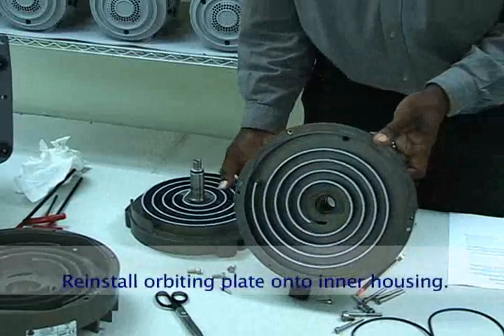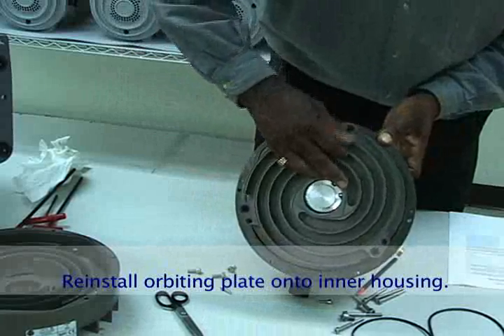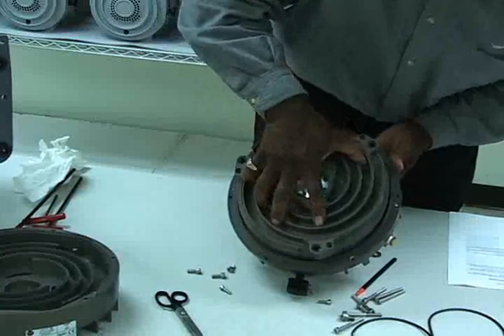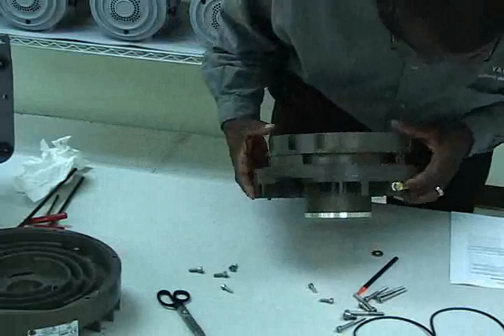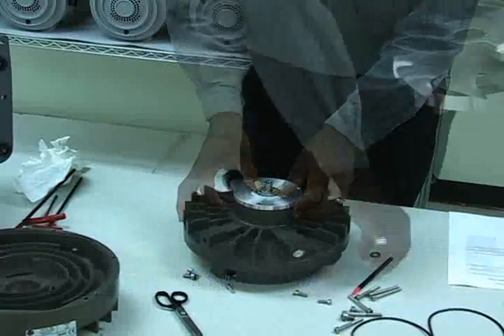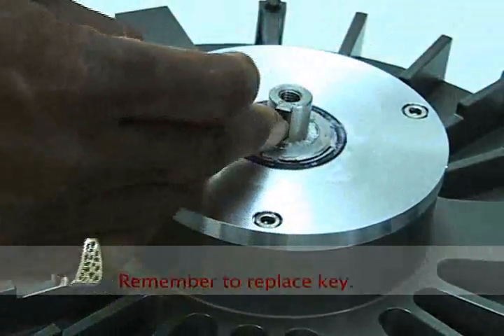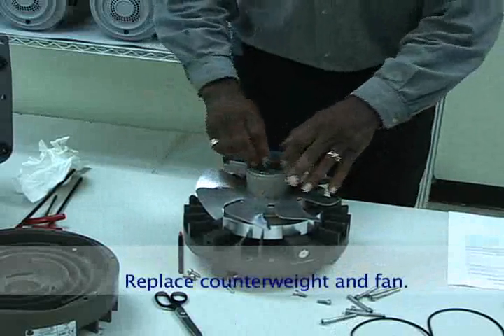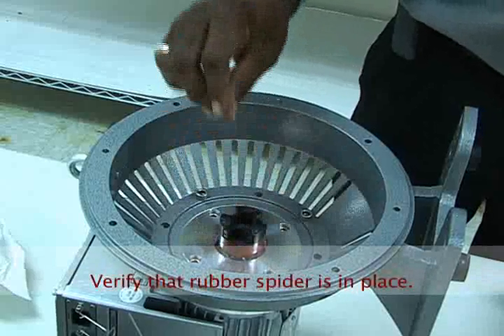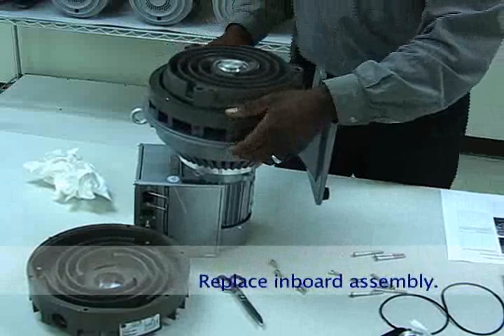Carefully reinstall the orbiting plate on the inner housing, sliding the crankshaft in place. Maintaining the housing in a vertical position will help ensure the tip seals stay in place. Gently rotate the orbiting plate to verify it is in full contact with the inner housing. Reinstall the fan assembly, making sure to place the key back in the slot on the crankshaft. Slide the counterweight and fan back on the shaft, then replace the washer and M8 screw and tighten. Verify that the rubber spider is on the motor coupling. Align the fingers on the fan assembly with the fingers on the coupling and set the inboard assembly in place.